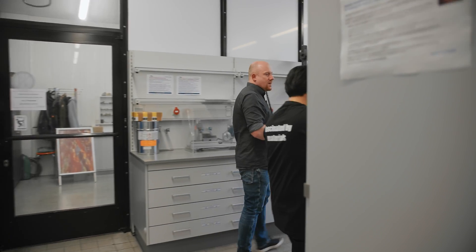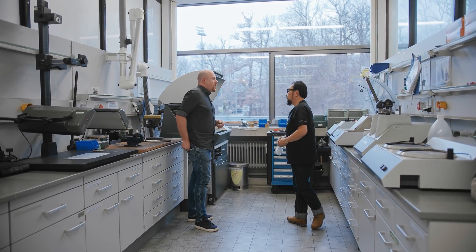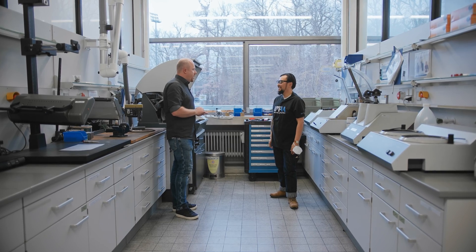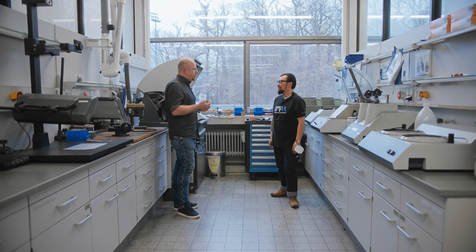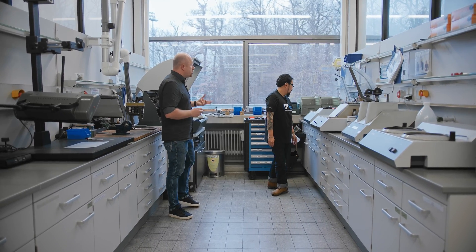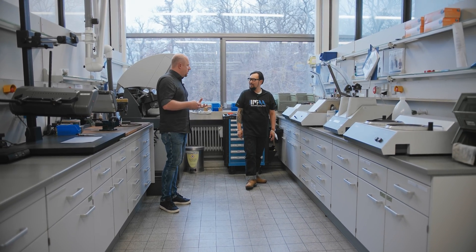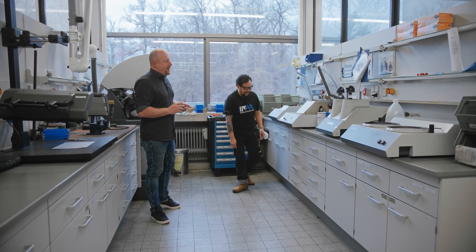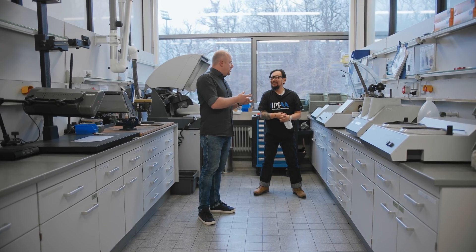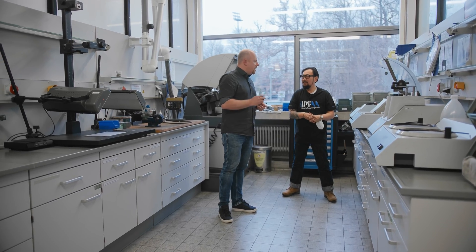Let's start here at our core facility. What we do here is we get our materials in every funky form. We have to cut little pieces out of it that are better for preparation. Therefore we have these different types of cutting machines — all water-cooled cutting machines — because you do not want to alter the microstructure due to heat. Except if you're doing heat treatment, but that's another story. If you have these little pieces, you want to have them handleable, so we embed them in these standard round specimens.